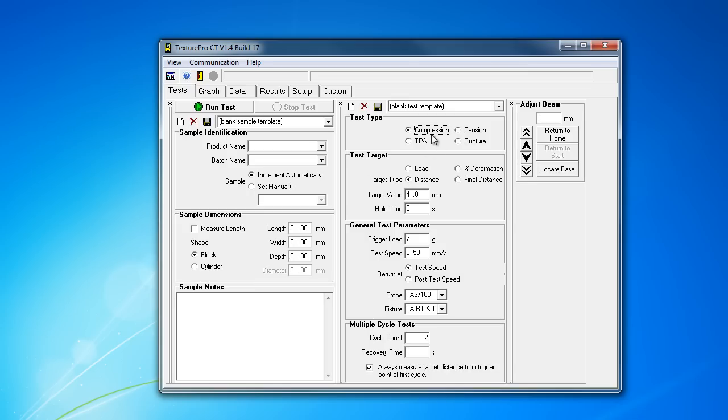What I'm going to do here is a basic compression test. Target type distance, target value. I'm just going to set the trigger load to 7 grams and then test speed to half a millimeter here. Make it a nice exact test.